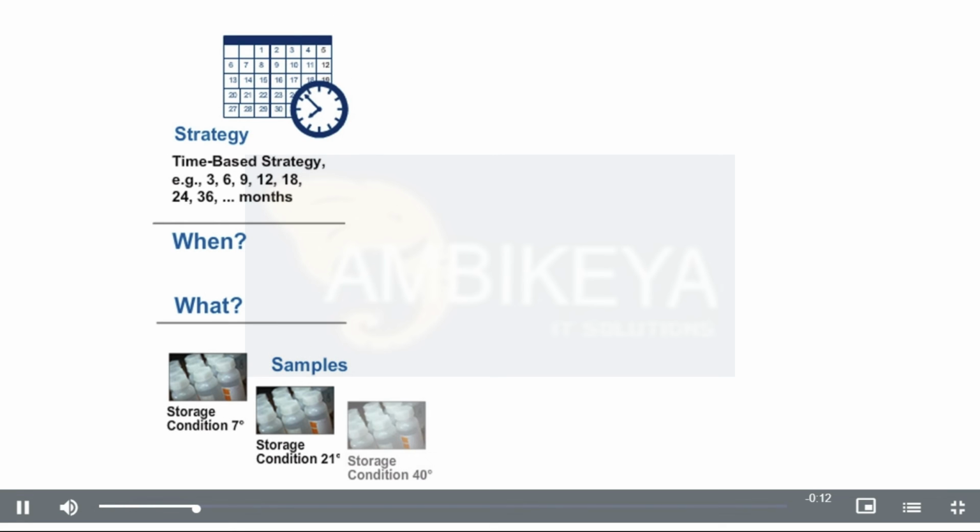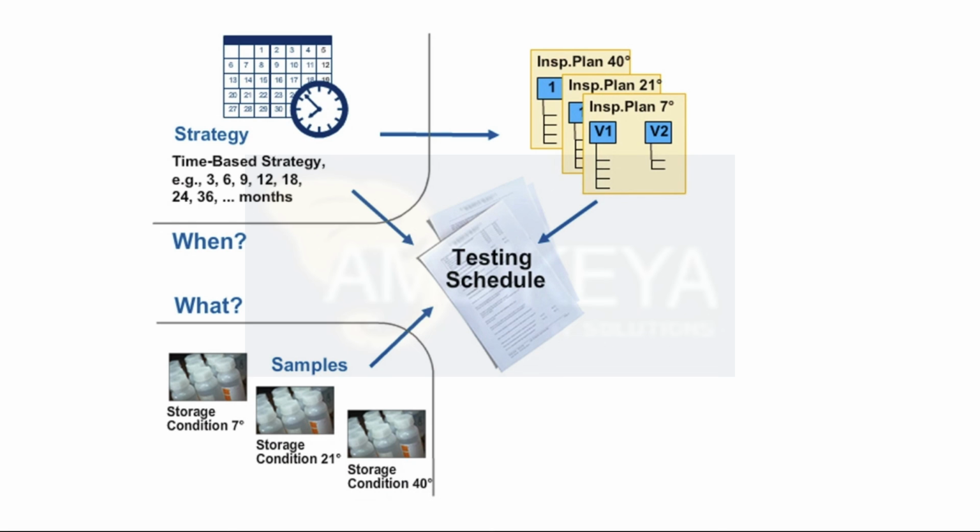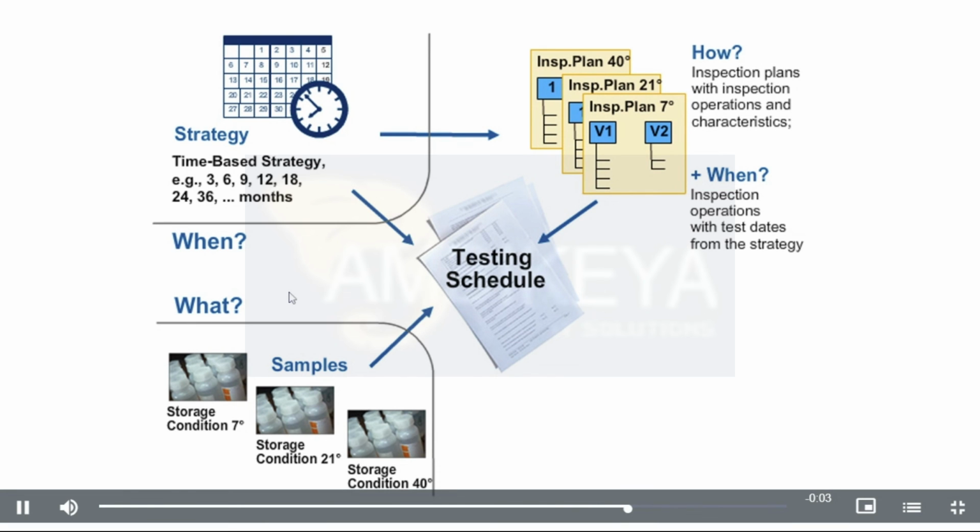The testing schedule specifies what is to be tested, that is storage conditions, when the stability tests are to take place, that is testing dates, and how the tests are to be executed, that is inspection plan.